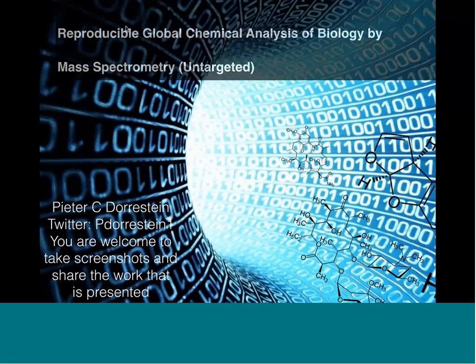So there's a couple of avenues that you can take. One of those is indeed reference data sets. So not just bacteria we're creating reference data sets for, but we're also creating reference data sets for food. So we have several thousand LCMS runs from different food samples that are going into GNPS soon. And these become reference data sets because a lot of molecules we see in fecal samples come from our diet, which makes sense. Then there are a lot of molecules that come from microbes, and so again, reference data sets.